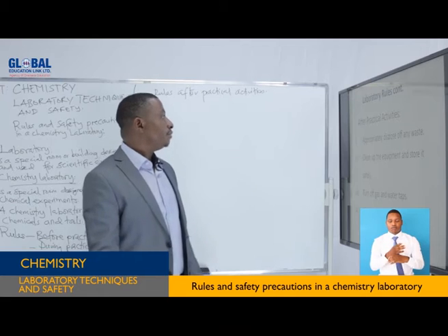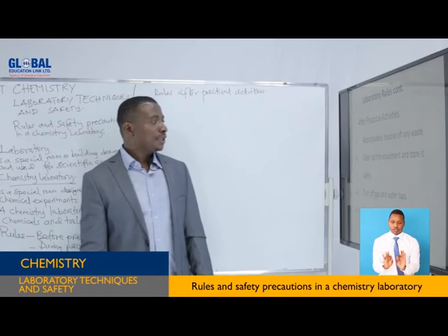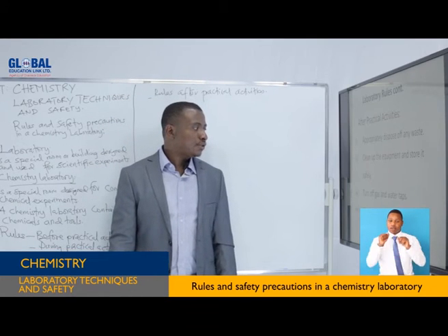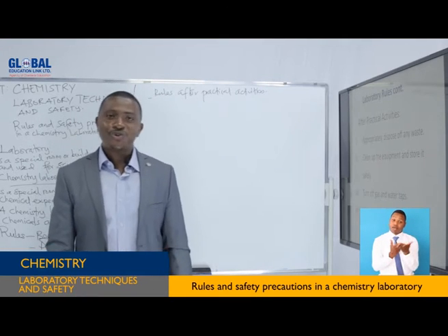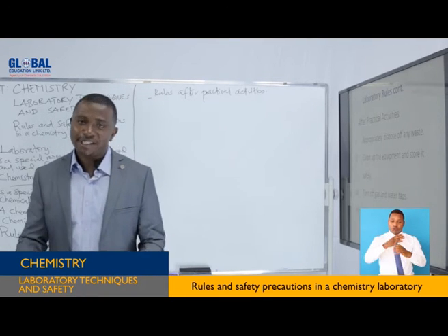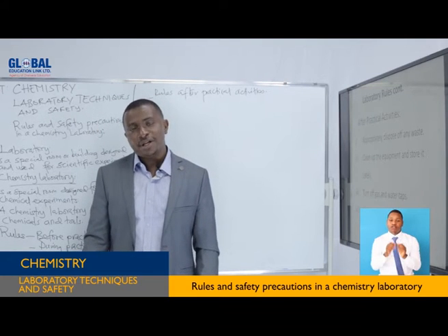The second rule after practical activities is that you should clean up the equipment and store it safely. Some of you, when you go to the laboratory, just perform an experiment and leave the apparatus uncleaned.